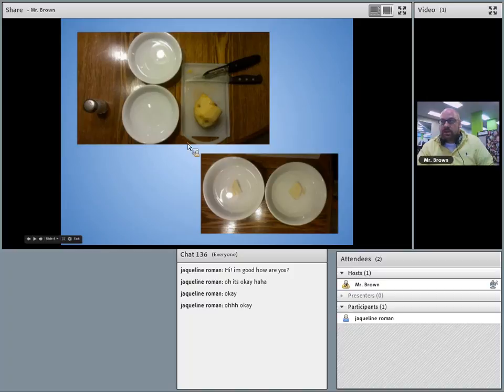So here's a little, okay. So roughly the same size potato pieces. Okay, fresh water, salt water. You are going to want to skin the potato. I did not say that in the directions. You are going to want to skin it. Okay, peel it. Alrighty.